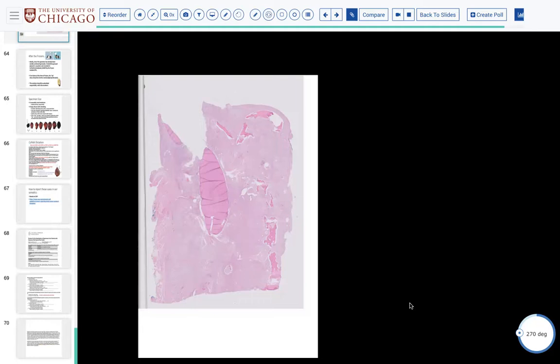However, once you have entered into the tissue plane and you can see it on the slide, you may not want to stop there. It is very, very okay to do multiple deeper levels into the tissue in excess of the standard 2, because those are so tiny.